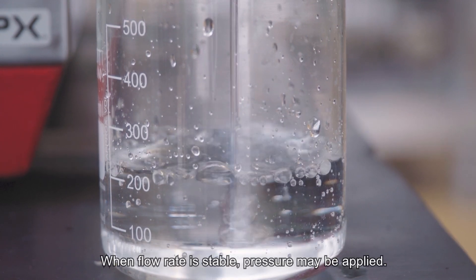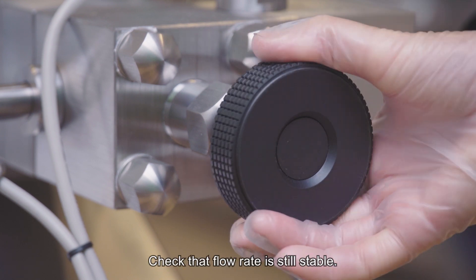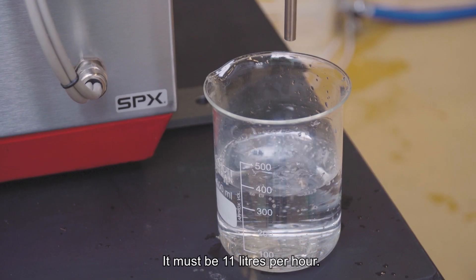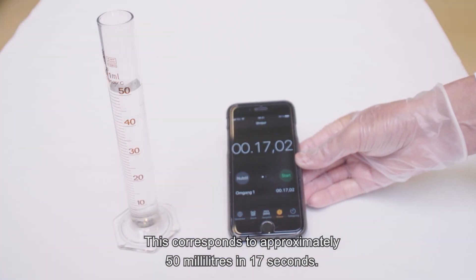When flow rate is stable, pressure may be applied. Check that flow rate is still stable. Measure the flow rate with a first stage pressure setting of 1000 bar — it must be 11 litres per hour. This corresponds to approximately 50 millilitres in 17 seconds.